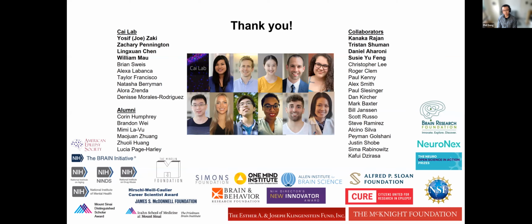I think we talked about this before, there's potential collaboration with MetaCell, who is hosting us here today. Maybe they can help maintain the package. They already help a lot in making automatic testing, all this stuff to make sure I don't break Minian whenever I try to do something. They have been really helpful in this. So maybe MetaCell can help. For the more long-term future plan, probably Denise can answer that better.